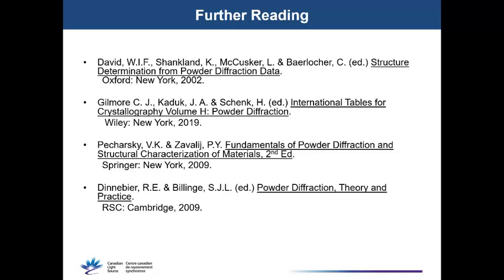There are limits though. And the higher a content you have, the more contamination you might get potentially of some of those intensities overlapping with the intensities you're interested in for solving the structure. So yeah, you've got to be very careful. In general, you want to start with the best sample you can.